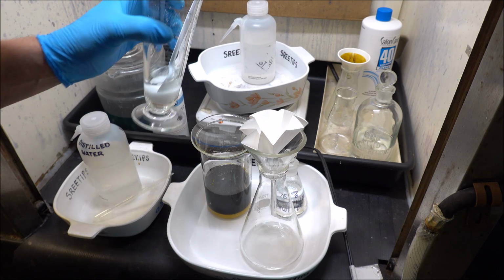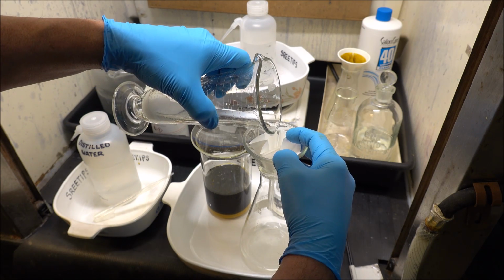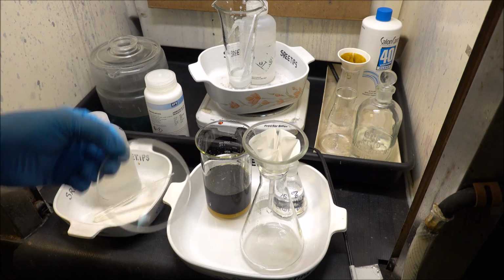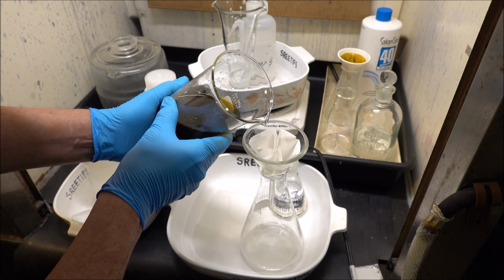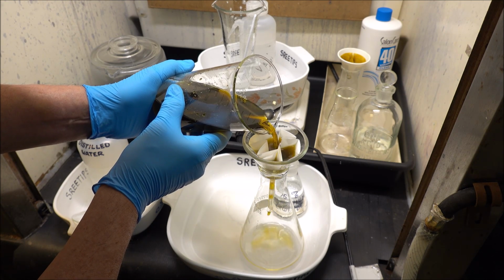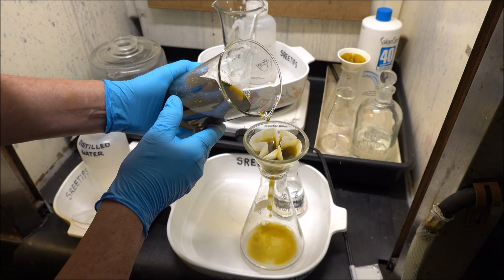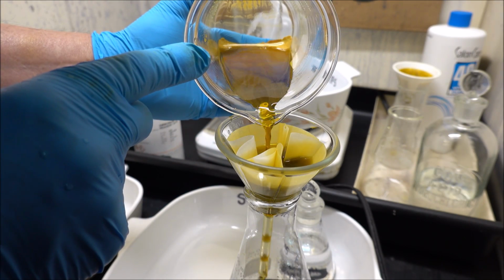This is ammonium chloride water. I'm going to moisten the filter paper with the ammonium chloride water. That brown liquid is our palladium solution. Here's our platinum salt.